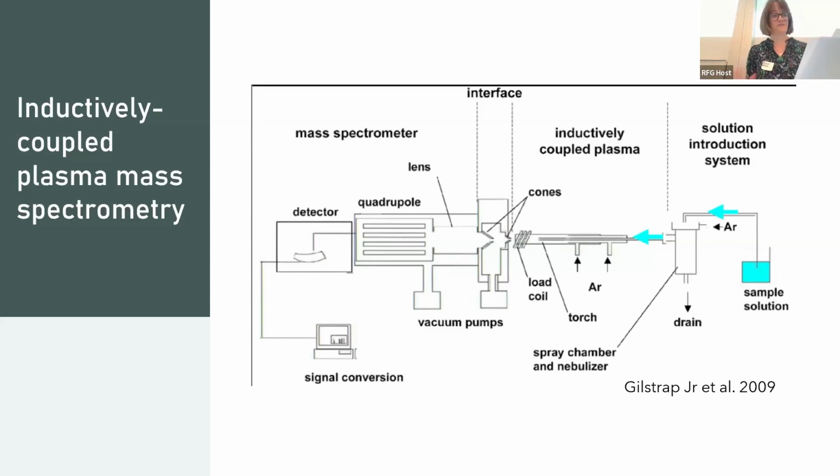Unlike XRF, as previously stated, ICP-MS is particularly good for identifying trace elements. But unlike XRF, there is a significant price tag attached to using this specialized equipment. As part of this project, the ICP work I will be conducting in the Durham University Department of Earth Sciences will be funded by both the BINS Fund and the Williams Bursary from University College Durham.